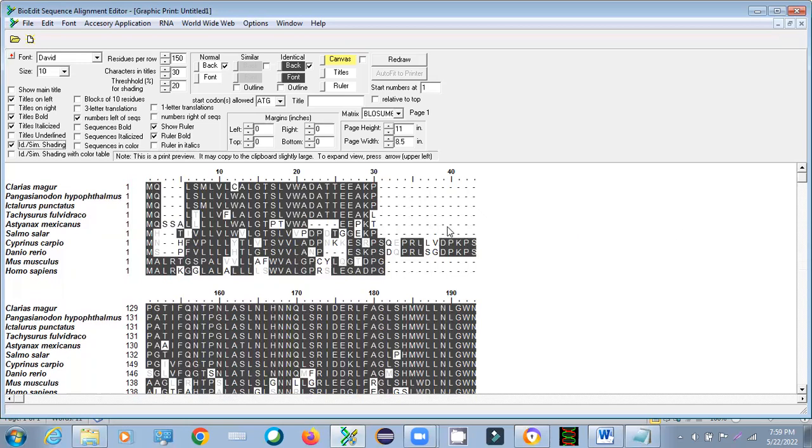If we export like this, I was facing this problem. That's why I'm making this video, so others who face the same problem can solve it. Here it is white, nothing is there. If you export this, only this much will come, up to 40, then it starts from 160. So from 50 to 150, the sequence is not there.